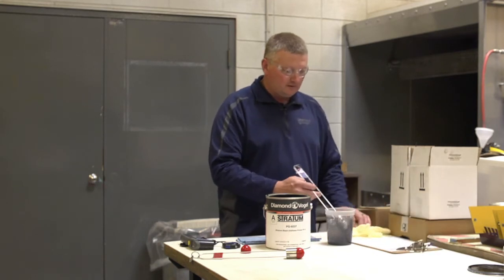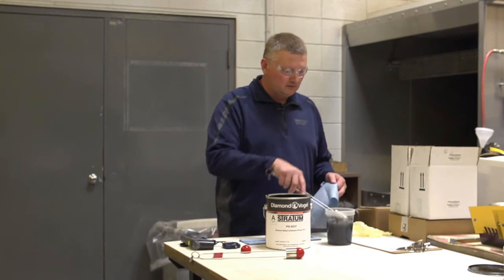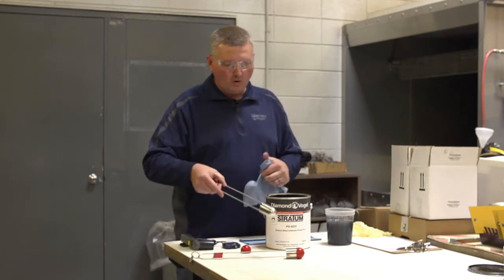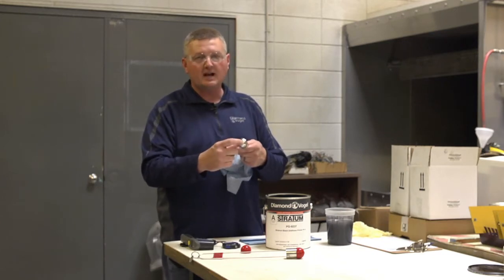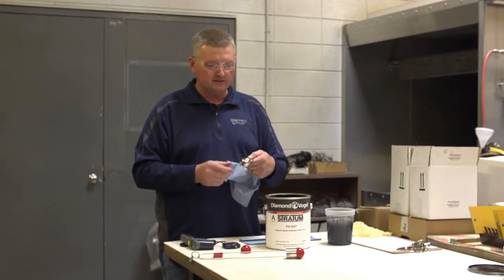So it's very important to always clean your viscosity cups. The cup itself — all of them hold the same volume of fluid; it's just the orifice size that is different on each one. One being the smallest, five being the biggest.